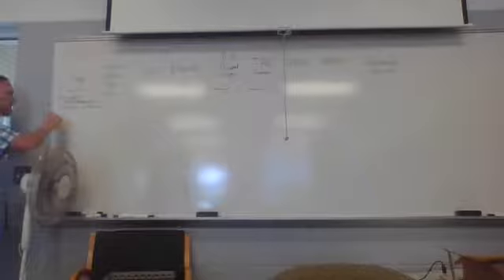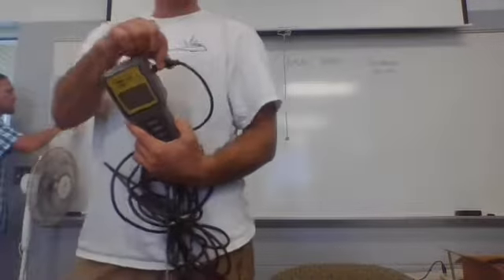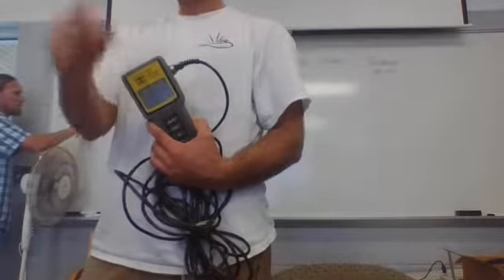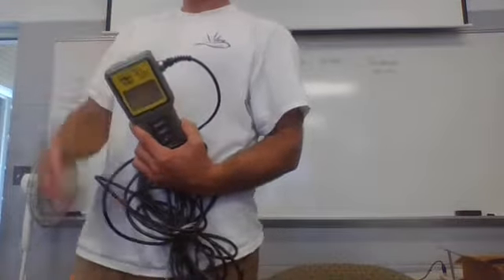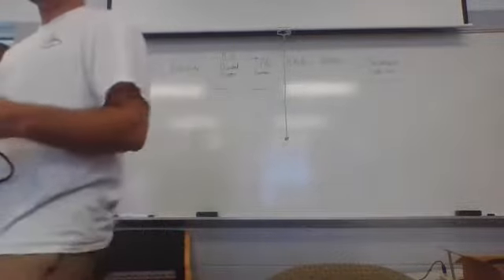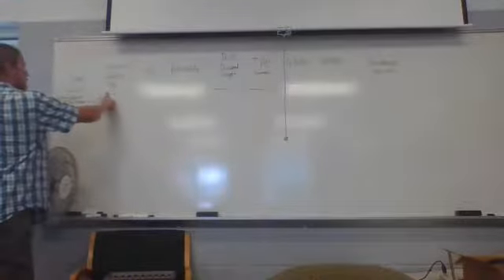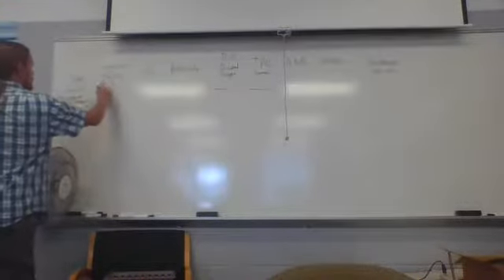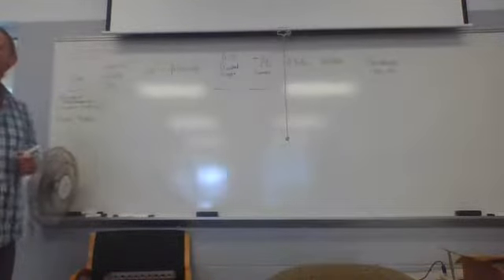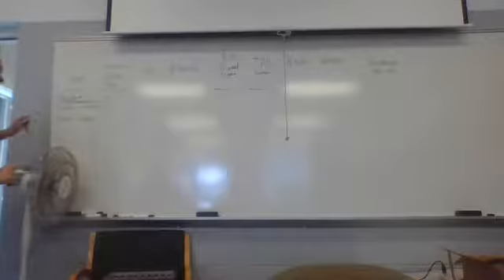Digital probe. Okay. So a lot of these meters have just a digital probe that's a little metal thing with two wires coming out of it that'll give you the temperature. I have some that are just straight temperature that you can hook up to a controller of some sort. Any other ways you can think of to measure temperature? Yeah, I was going to say get your finger in. Right. The old feel test.